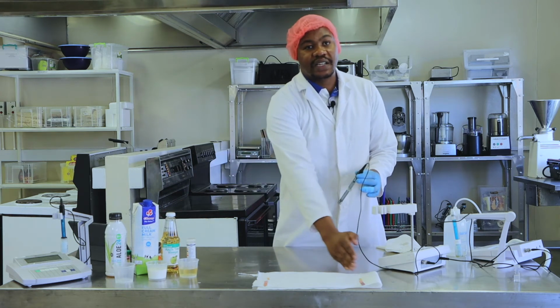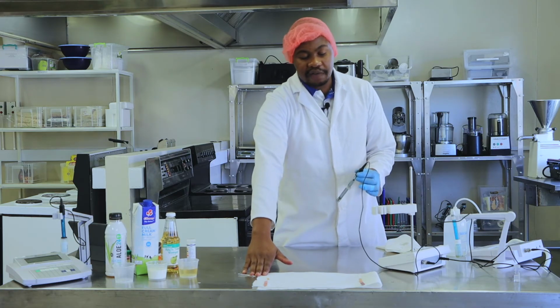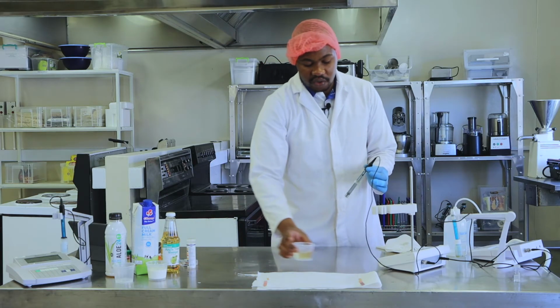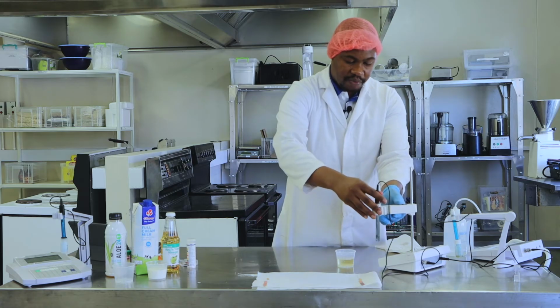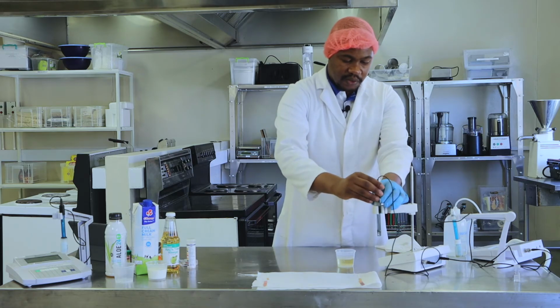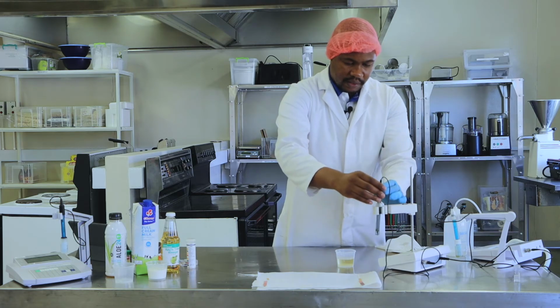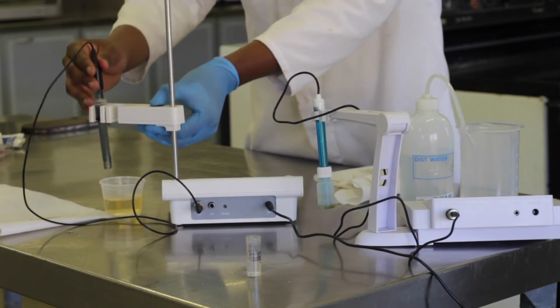Remember, we've also done the same thing with the test strips. So here I've got my apple cider vinegar, here I've got my milk solution. So you can take your cider vinegar and put your pH probe back here. Let me just do it like this. Right. And then you can put your solution over here.